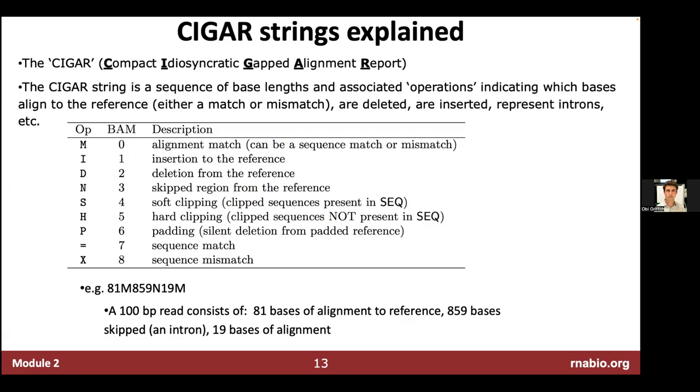When we created the BAM file, we combined read one data and read two data, right? Each entry in the BAM file starts with one read, but gives you a little bit of information about the paired read. Would there be another entry for that paired read?